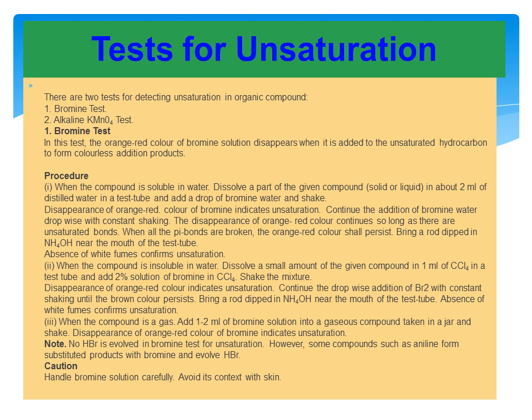But what specific procedure are we going through? Actually, it depends on whether the compound is soluble in water or insoluble in water. When it is soluble in water, it means that it has some affinity, and for that purpose you simply use the compound and distilled water and so on. But when it is insoluble in water, then you have to go for some organic solvent, selection of an organic solvent. So firstly, we go through the procedure supposing that the compound is soluble in water.